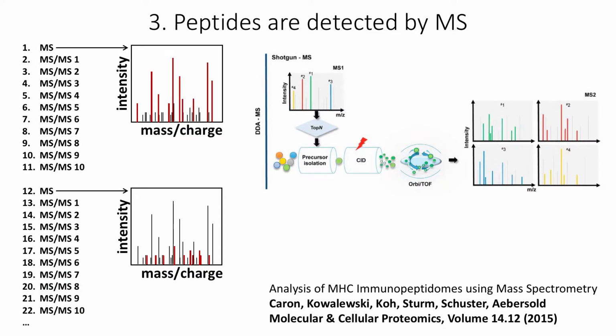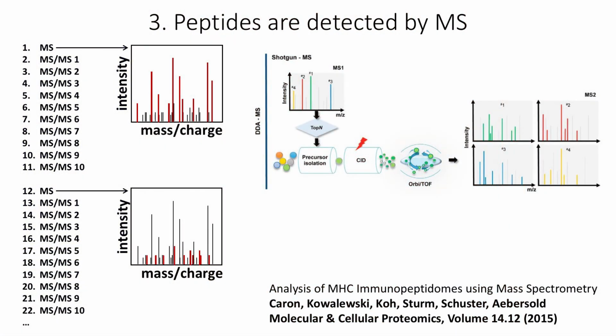So the next assumption that you hope you have when you detect HLA peptides by mass spec is that you actually select them for MS-MS. This is a full scan spectrum, and usually what we do, we take the 10 most abundant ions, individually isolate them, fragment them, then we acquire another full scan, and that usually is less than 3 seconds later, so the spectrum hasn't really changed much. And whatever we just isolated is on an exclusion list, and we go to the next most abundant one.